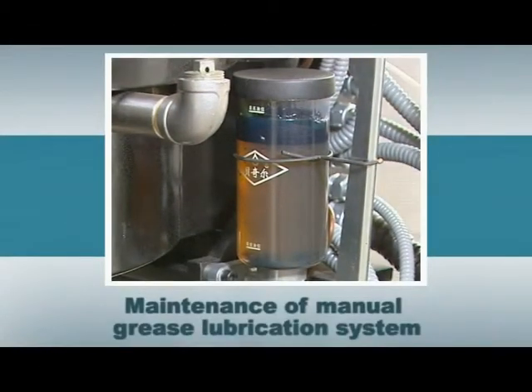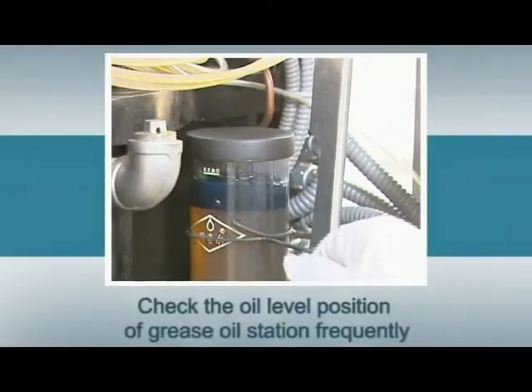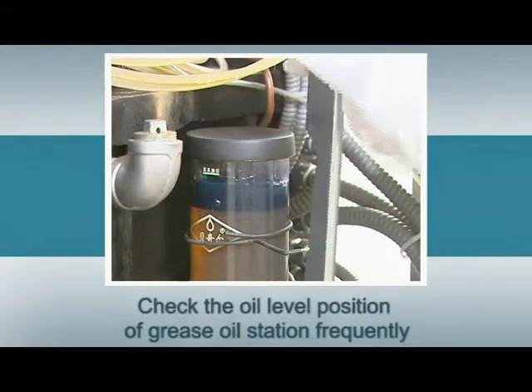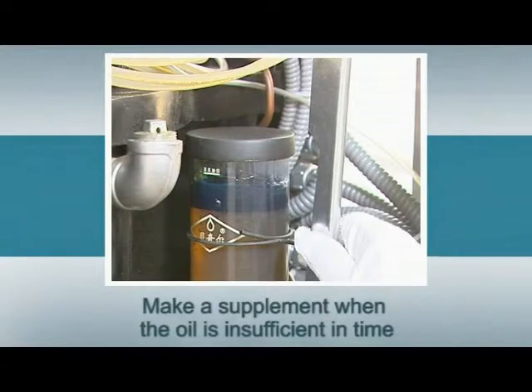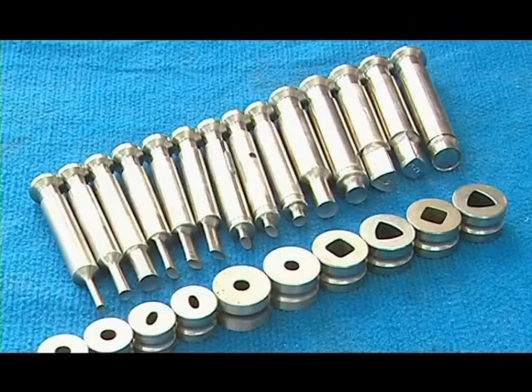Maintenance of a manual grease lubrication system. Check the oil level position of the grease oil station frequently. Make a supplement when the oil is insufficient in time.